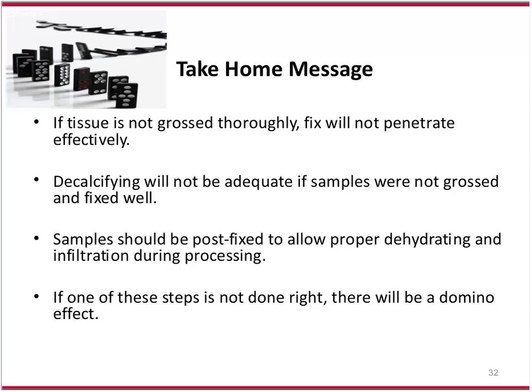Decalcifying will not be adequate if samples aren't grossed and fixed, as I said. If something is grossed wonderfully but fixed for a shorter period of time, you're also going to have the same problem with your decalcifying agent. It's not going to work right, and your samples are not going to cut right, and it's just going to be so frustrating for the technician at the microtome.